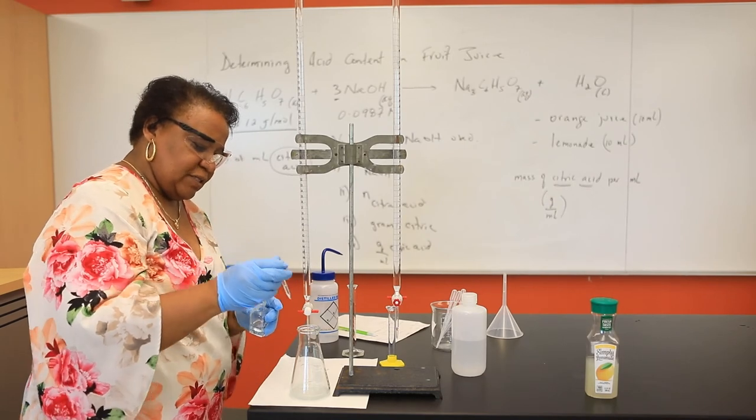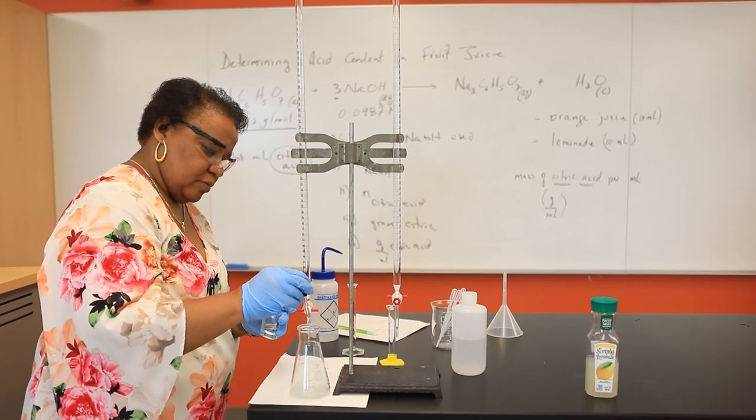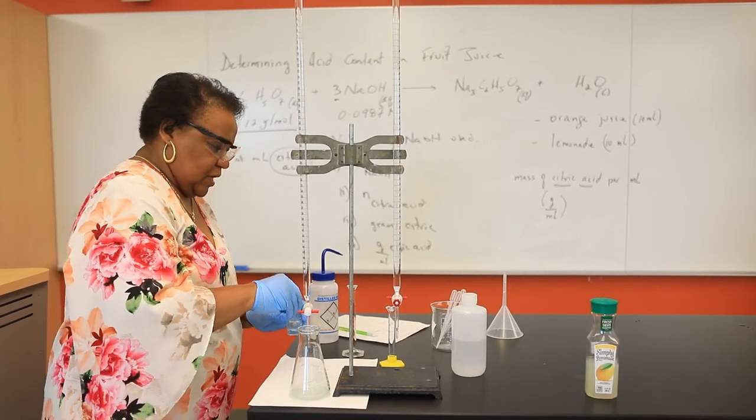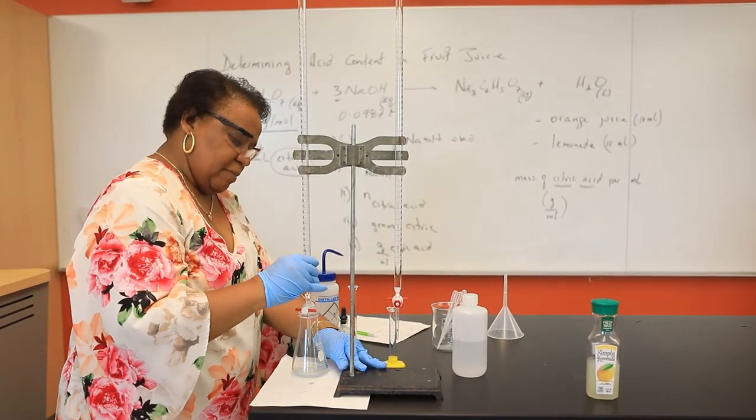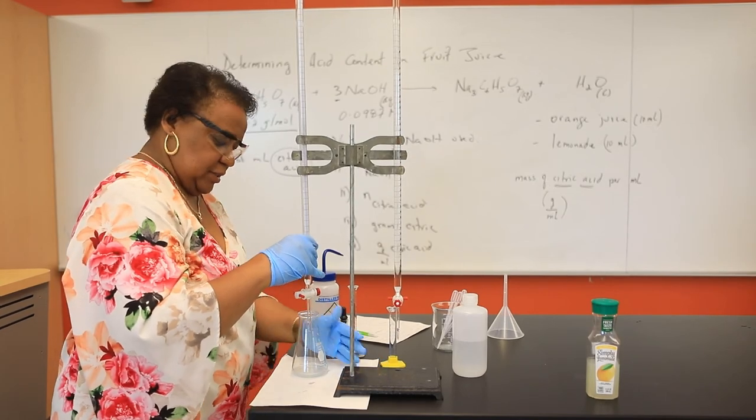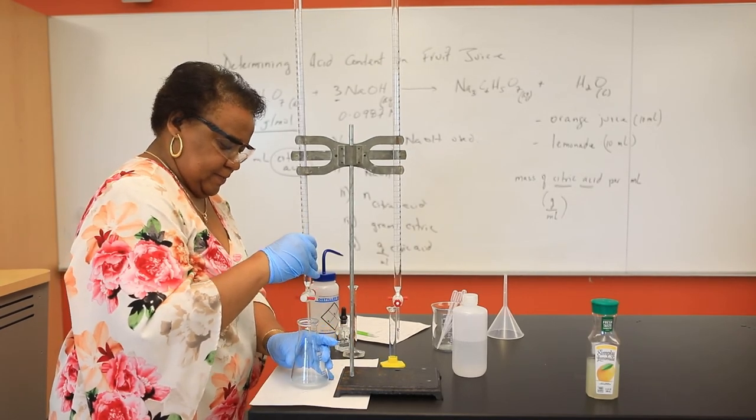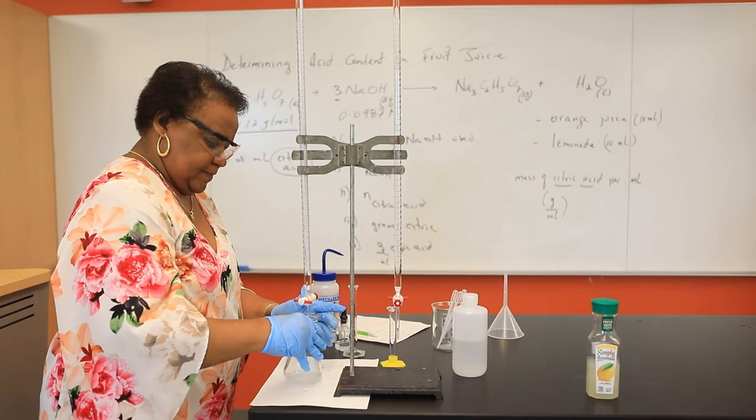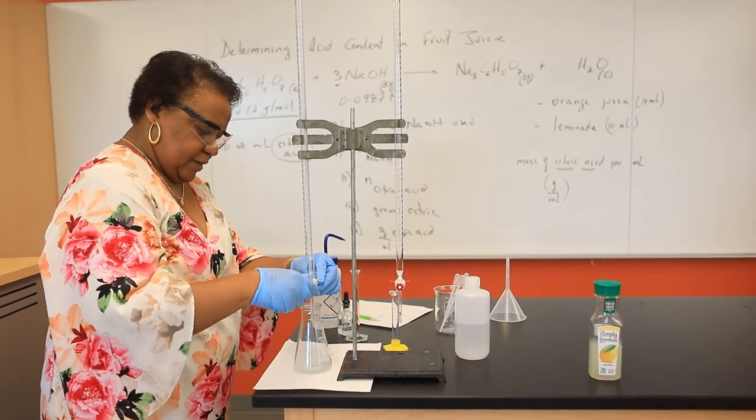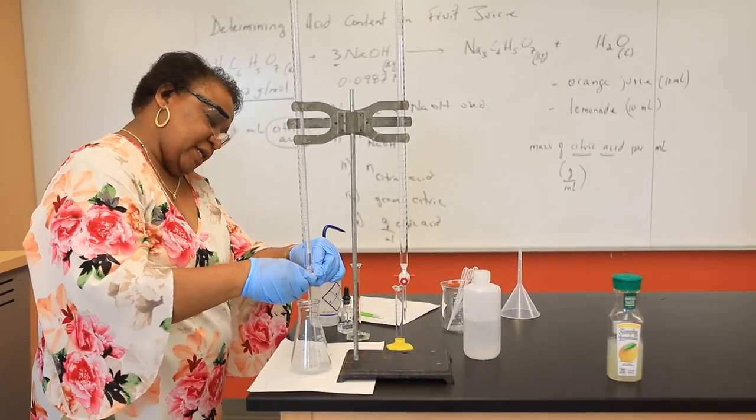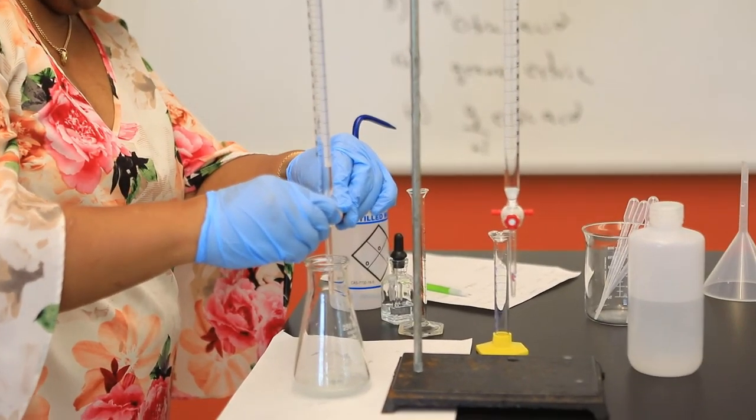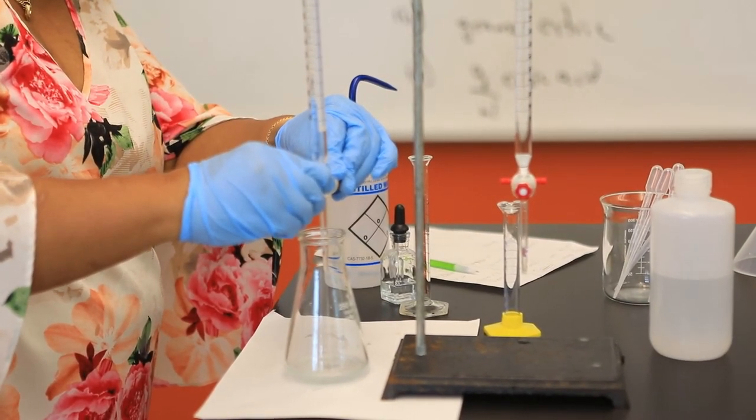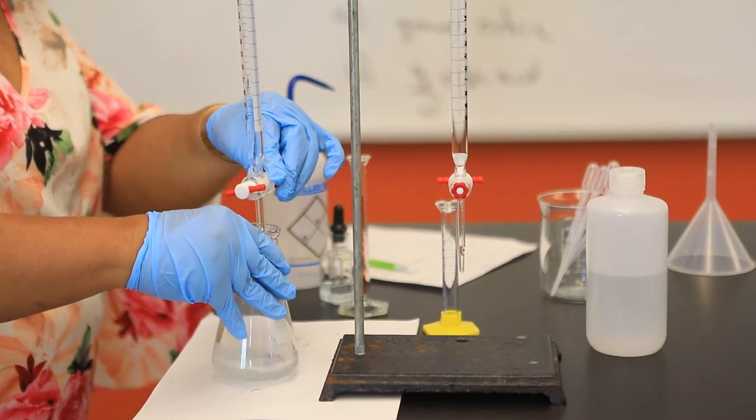Here goes our few drops of indicator. Then I'm going to proceed with our titration, making note that the tip of the burette is filled. Lemonade is a clear solution, so the good thing is that we should be able to readily observe that color change.